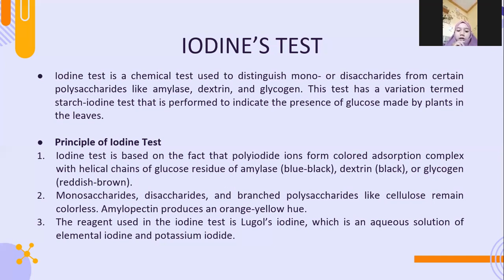Number three, the reagent used in the iodine test is Lugol's iodine, which is an aqueous solution of elemental iodine and potassium iodide.